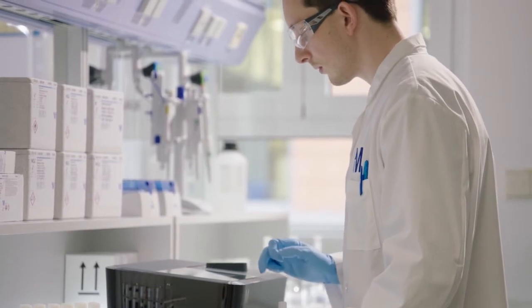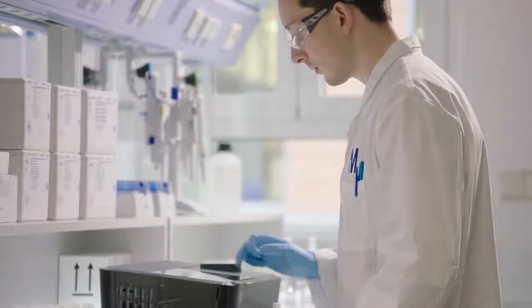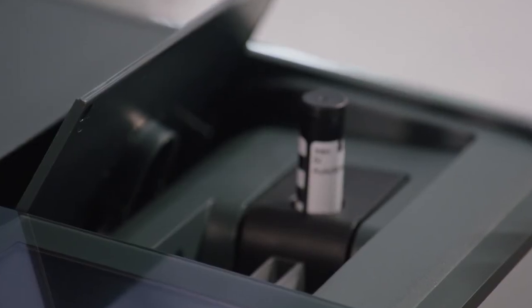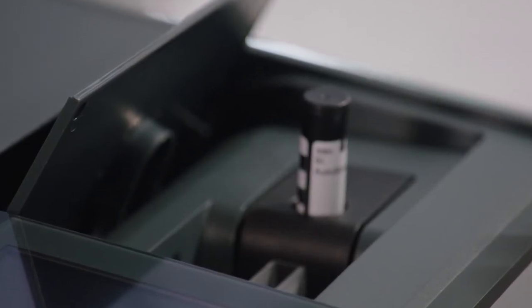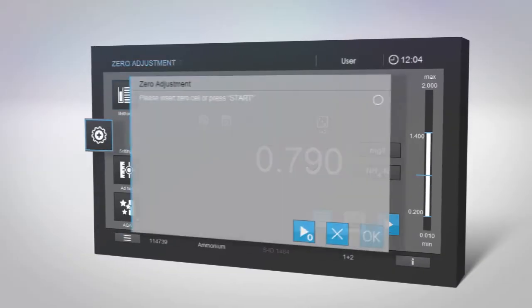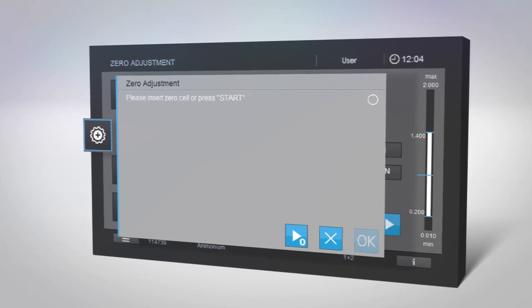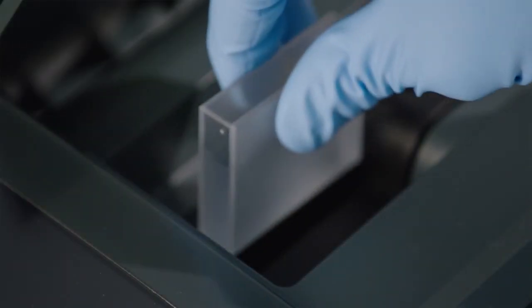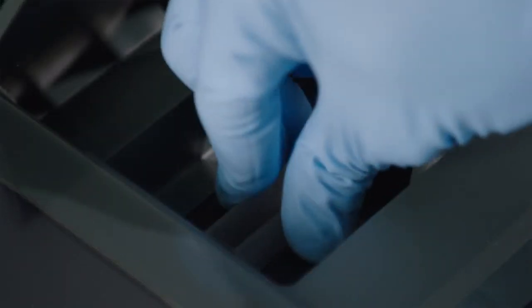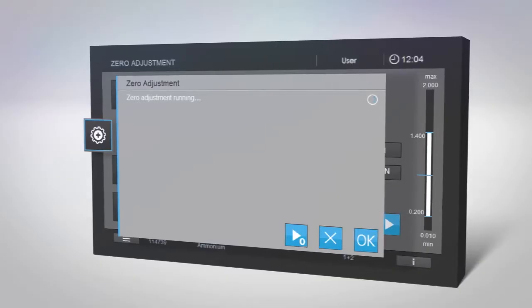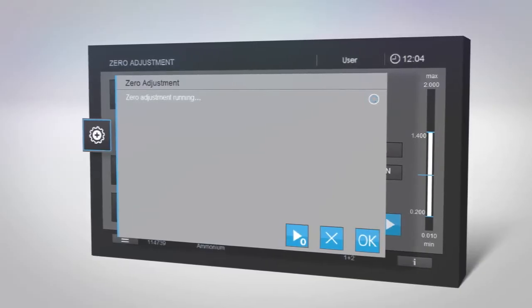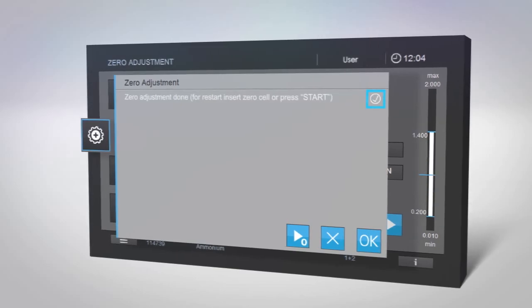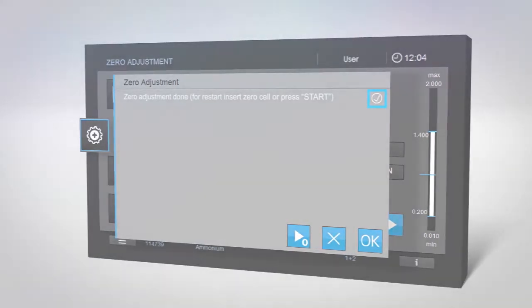Thanks to ambient light protection, there is no need to close the lid during measurement. If you need to perform zero adjustment, remove the cell with your sample, select zero adjustment and insert a cuvette with distilled water. The measurement will start immediately.